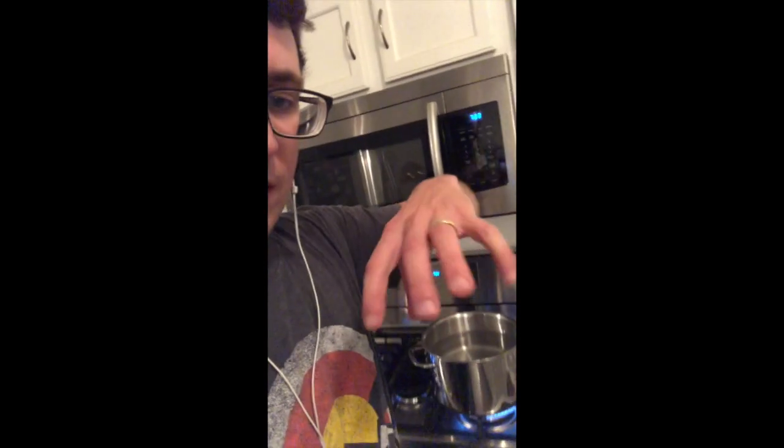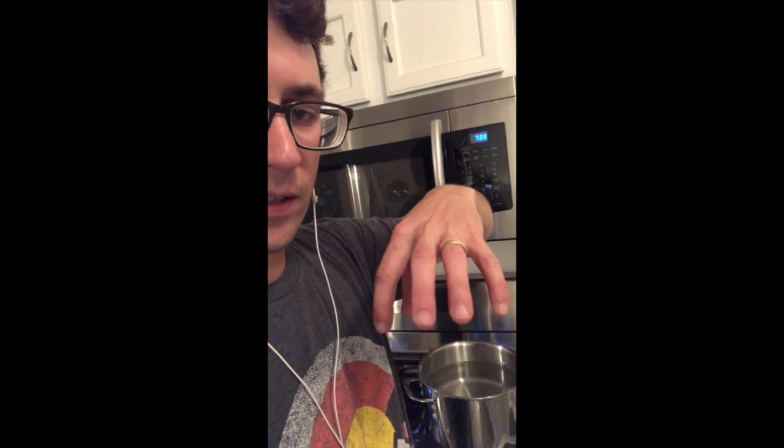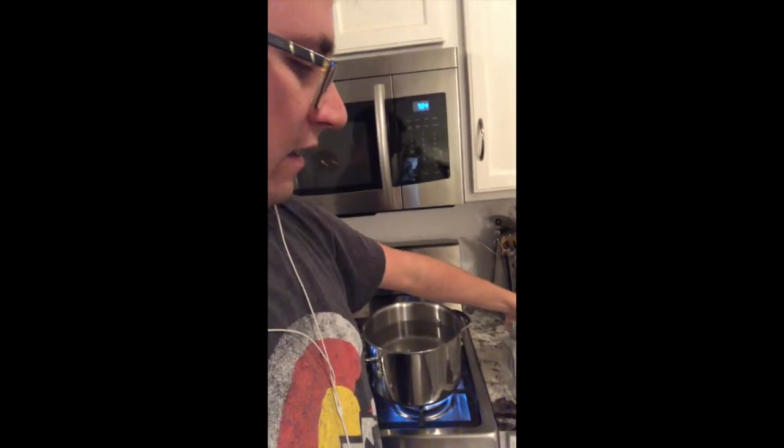All right. Hey guys, so I actually found these jars that are glass on glass, which I'm gonna test out. I really like the glass on glass idea because normally when I use the mason jars, I screw the lid tight and then a quarter turn less so that the seal doesn't create a vacuum and crack the glass jars. But these are pretty hefty, and with that glass on glass, I know I'm not going to get any boil over or a seal to cause cracking. And these ones have a really nice square grip, so I feel like they're going to be easy to pour. So we'll get to test these out together.